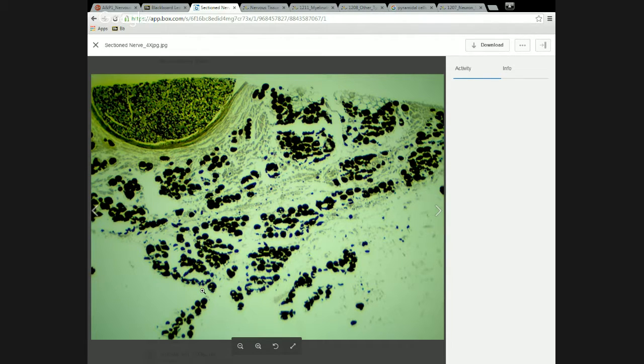I'm just doing that to point out what the stain is showing us. The adipose tissue that we've seen in the past is kind of a negative image of this. This is a lipid stain, essentially, and otherwise we look at things like this with cell stains that stain cytoplasm and DNA and nuclei and those kinds of things. So everything that we don't see here is what we would see in a cell stain of adipose tissue. So they're sort of negative images.